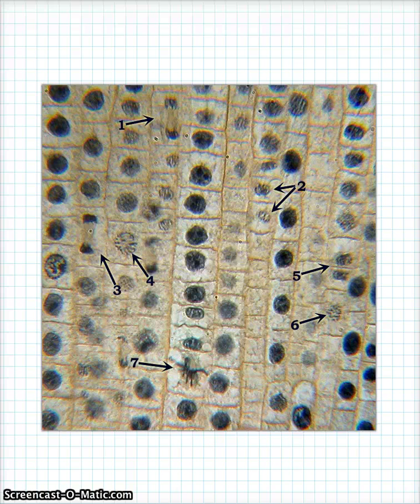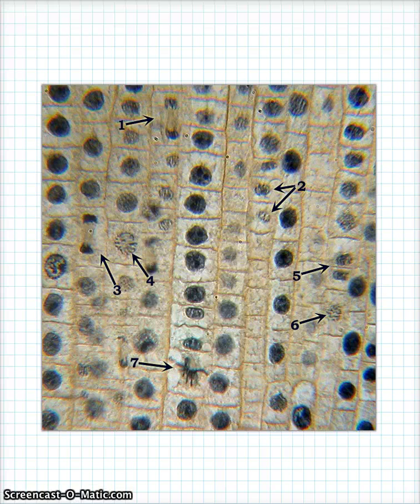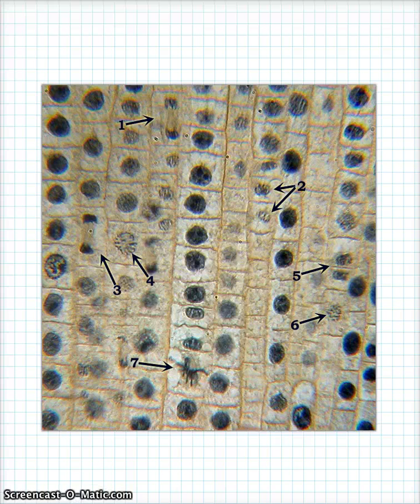Now, number one. Number one would be telophase. Number two, telophase. Number three, late anaphase, early telophase. Number four, prophase. Five, telophase again. Man, this is a lot of telophase.